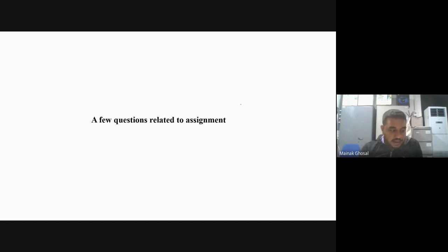If you are able to give this information, you will be able to get the structures. In some questions proton NMR data is always given, mass data is given in some and not in others, and carbon data is given in one or two questions. So let's start with question number 1. You need to identify the structure of the compound from the given data, interpret the data and arrive at the structure.